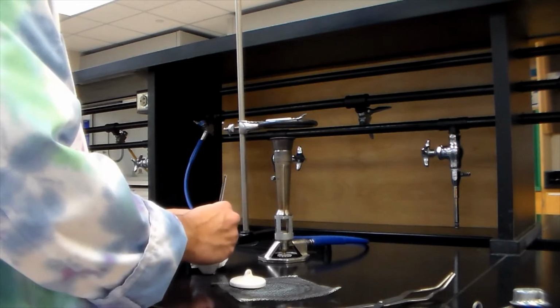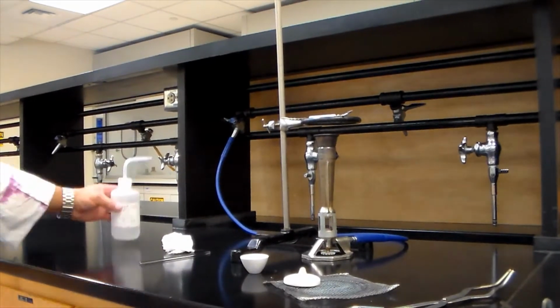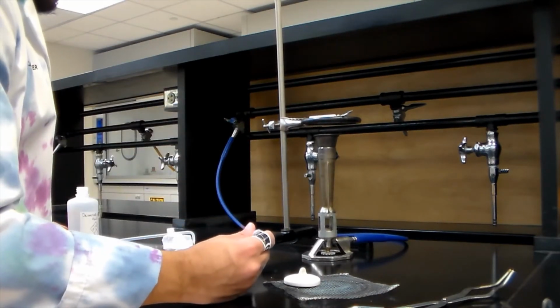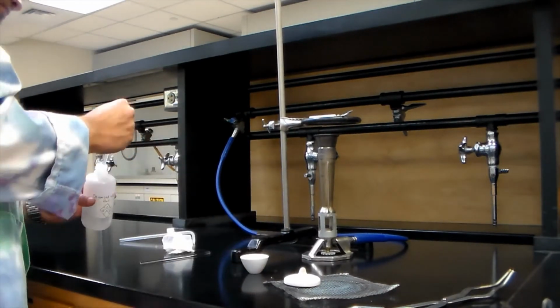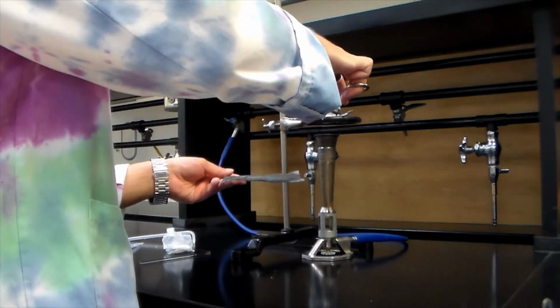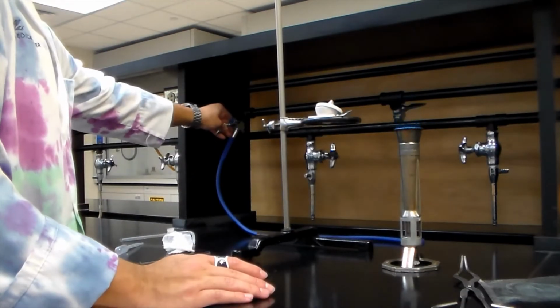Allow the crucible and product to cool until you can no longer feel heat radiating, then add a few drops of DI water to moisten the oxide. This will convert the magnesium nitride to magnesium hydroxide. Return the crucible to the iron ring. Slightly open the lid, then brush heat the crucible until the water evaporates.